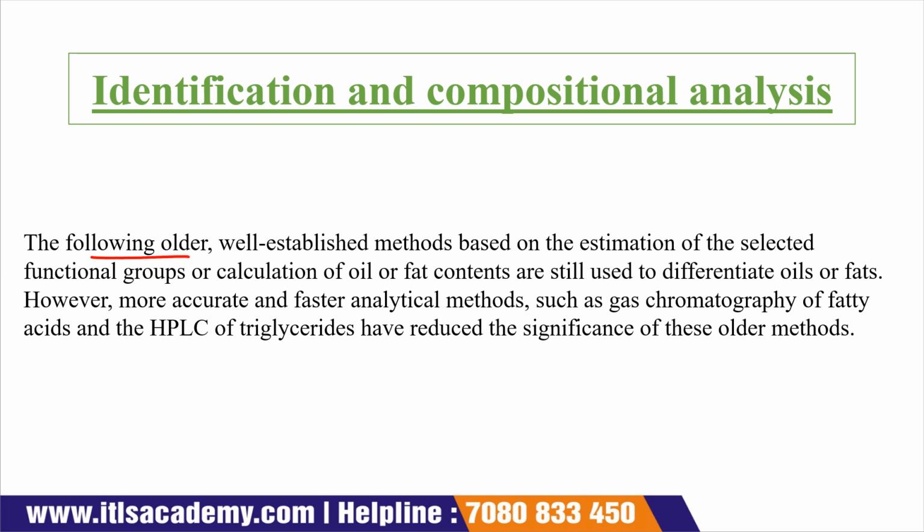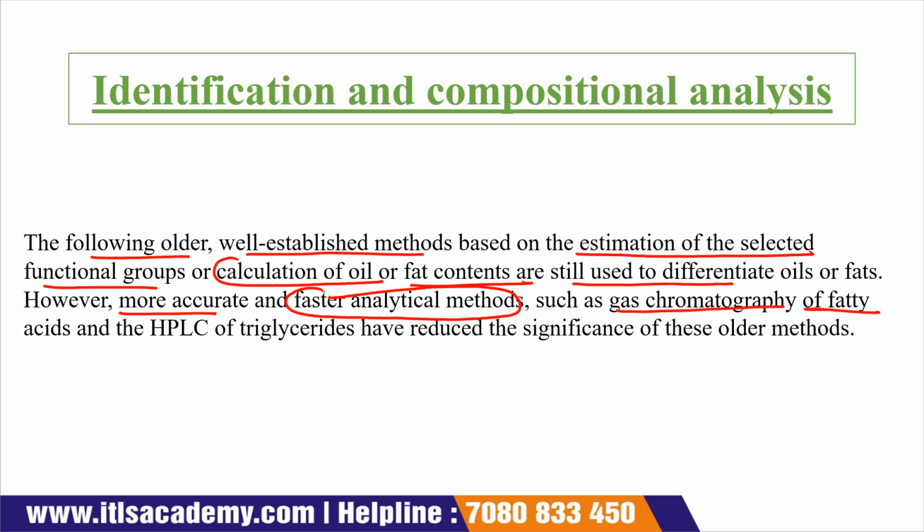Now the next one is identification and compositional analysis. The following older well-established methods, which are based on the estimation of selected functional groups or the calculation of the oil or fat content, are still used to differentiate oil or fat. However, more accurate and faster analytical methods like gas chromatography of fatty acids and HPLC of triglycerides now reduce the significance of these older methods.